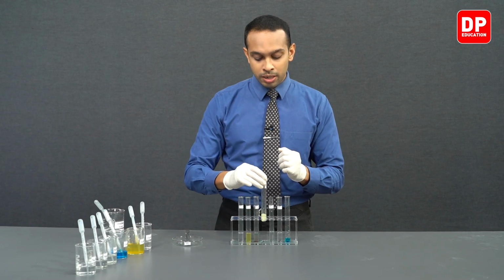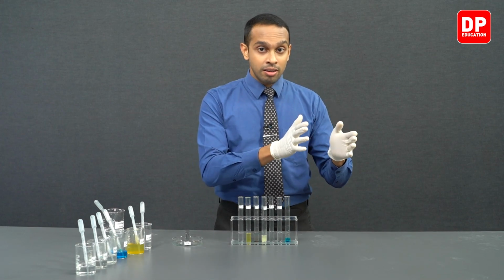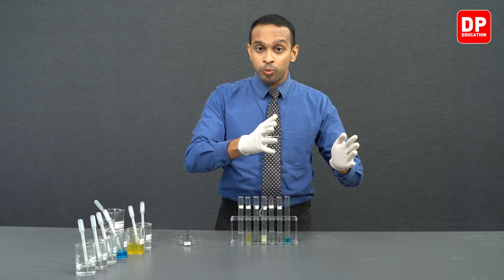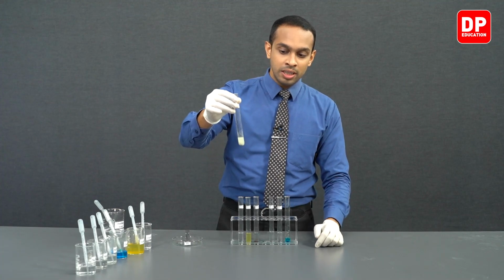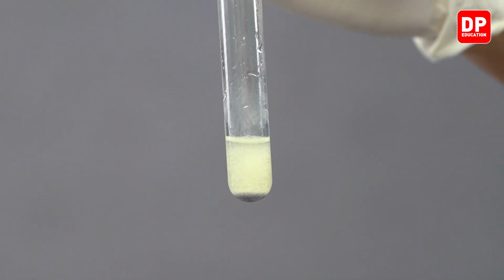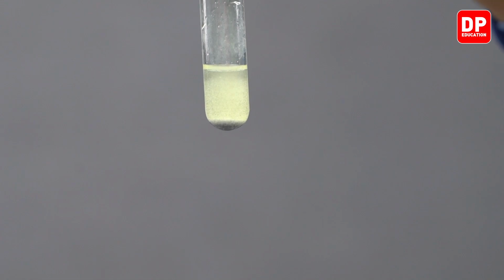So as the lead metal gets formed, it will precipitate to the bottom of the test tube, and the iron piece that we added into the solution will get oxidized to form Fe2 plus, and that is why the medium over here is turning a little bit of a yellowish green color as iron turns into Fe2 plus ions.